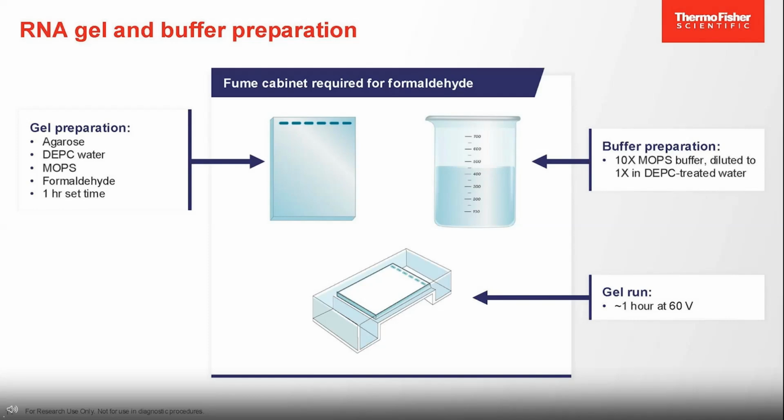And overall, I would very much like to stress that when possible, please either treat all of your flasks or all of your working environments with RNaseZap, or make sure that you work in an environment that has already been dedicated to RNA, to limit the exposure and the chance that your RNA sample will be degraded.